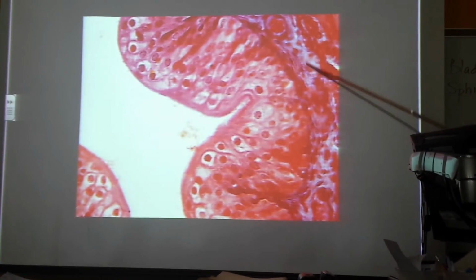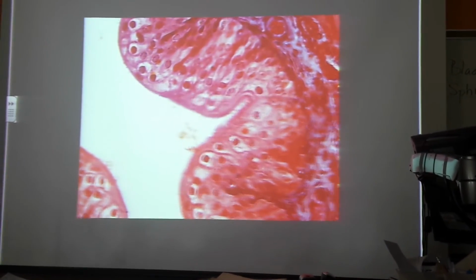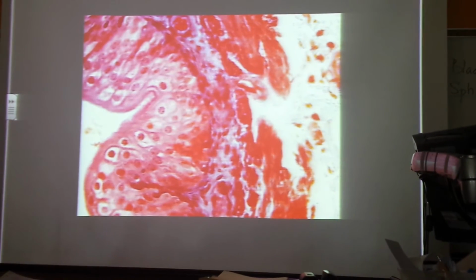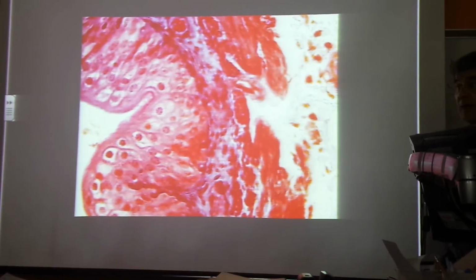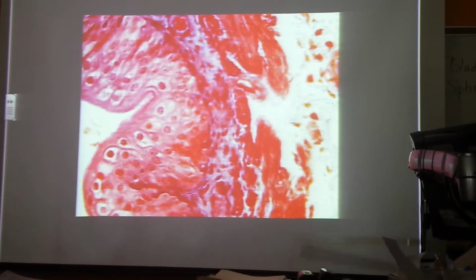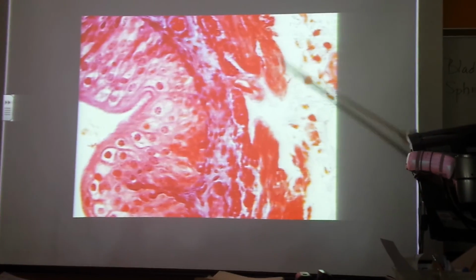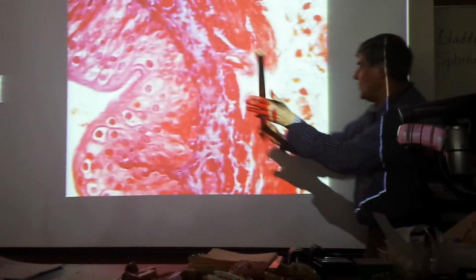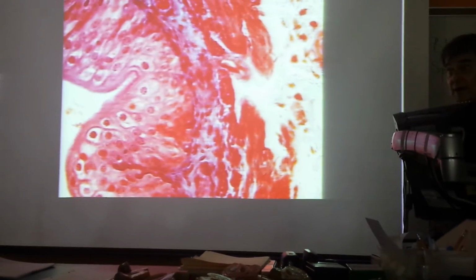This kind of bluish area here, lamina propria. That's that loose connective tissue deep to the epithelium. Now here are the muscle layers. Inner longitudinal smooth muscle, so that's the tissue, smooth muscle, the arrangement, longitudinal. On the outside here, it is circular. It runs around the circumference. Longitudinal again would come out of the plane of the screen. Just the reverse of what we saw in the GI tract.